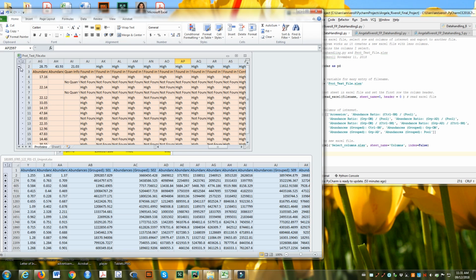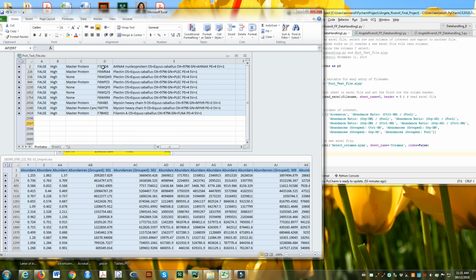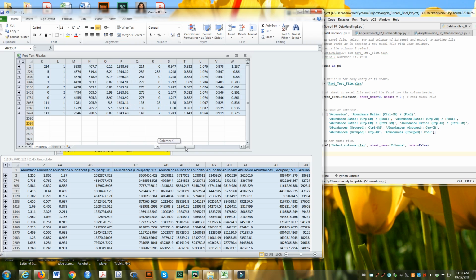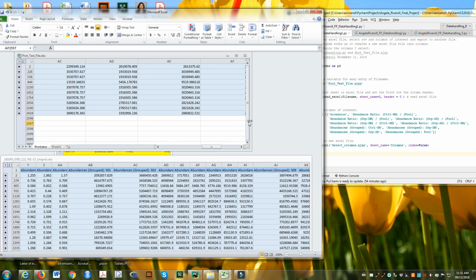So I'm not really interested in all those lines. I'm really interested in line 2, 226, and none of the lines in between. So I needed to find a way to be able to select rows that contained only these accession numbers. And also, I'm really not interested in all of the columns all at once. I'm more interested in this case in the mean abundances for each of the particular conditions. So my control and then my two conditions, and these are the mean values.